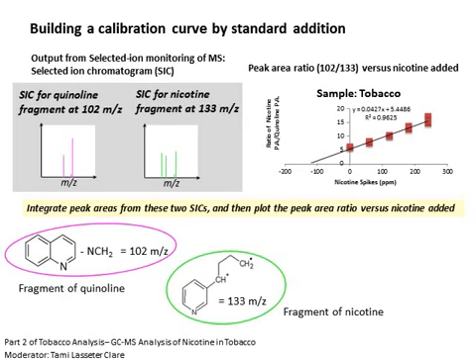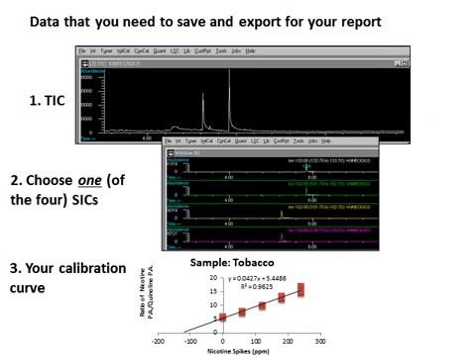Having mentioned statistics on the fit, we need to figure out the error in the X data. One trick to get at this information is to switch the axes, plotting the concentration on the y-axis and signal on the x-axis. For a more complete explanation of standard addition and quantification, please see the lecture notes and the separate documents about some of the statistical calculations that are needed for this and for other lab reports.